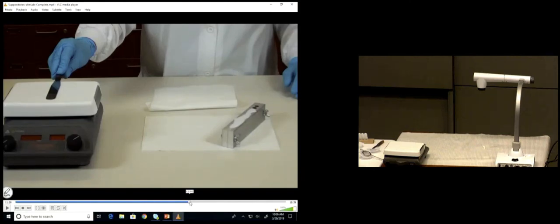Also, take a damp paper towel before you do anything, and sometimes even between steps, and wipe the top carefully. Again, because any wax or anything that's on the spatula in a minute, or anything that gets on there will start to smoke and stink really bad. If that happens, let me or Judy know. We'll clean it up, but we don't want you breathing the toxic smoke. Let us know. We'll clean it up. And it helps before you even turn it on, make sure it's clean and nothing will smoke.